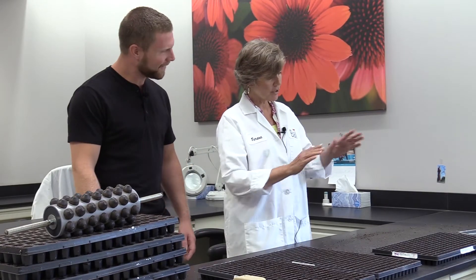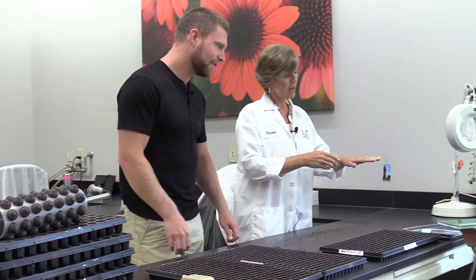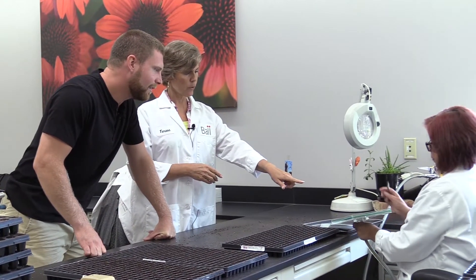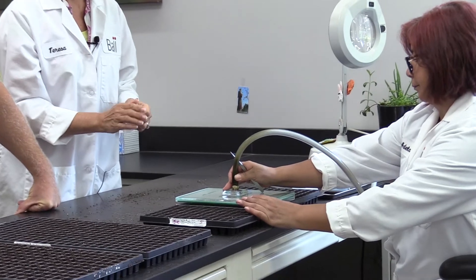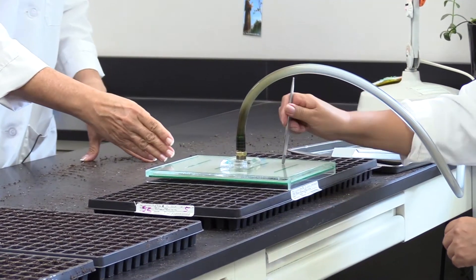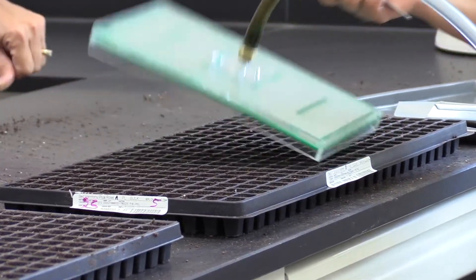Now Adela is going to show us how we do the sowing. We actually sow on a plexiglass plate here, and she's going to be sowing 96 pellets into one rep. For each test we do, we do either three or four reps, so she's going to do one in this tray, one in this one, and one in the other.